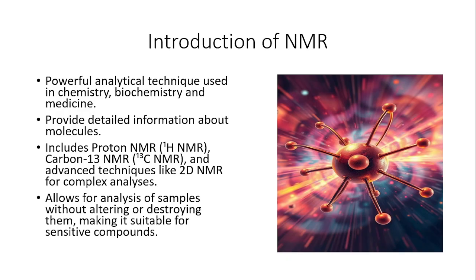Today, NMR has become an essential tool in identifying and analyzing chemical structures due to its non-destructive nature and detailed information. It plays an integral role in molecular structure determination, particularly in organic chemistry, as well as in the medical imaging technique known as MRI.